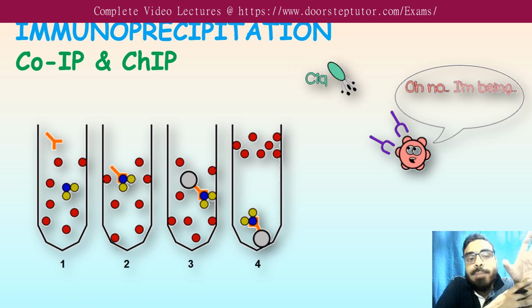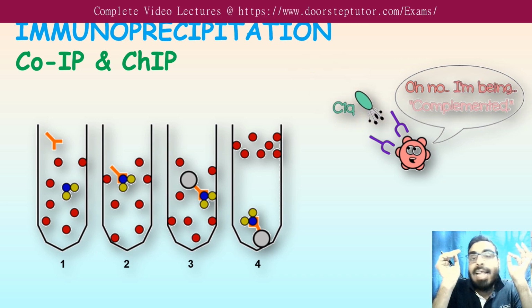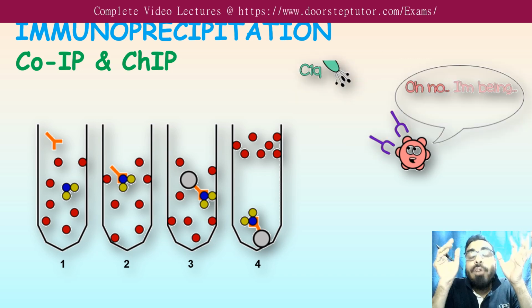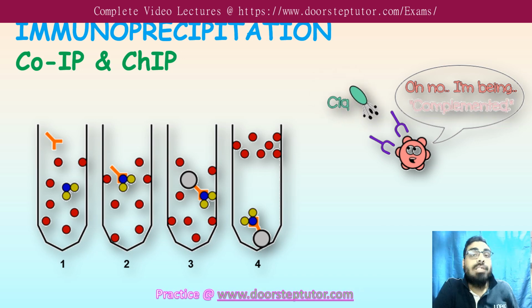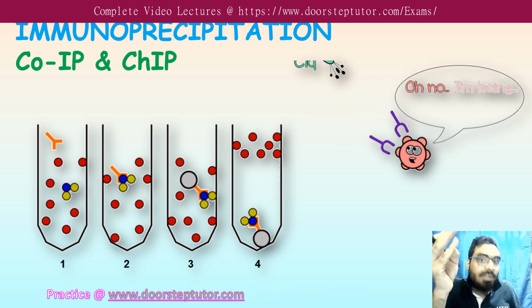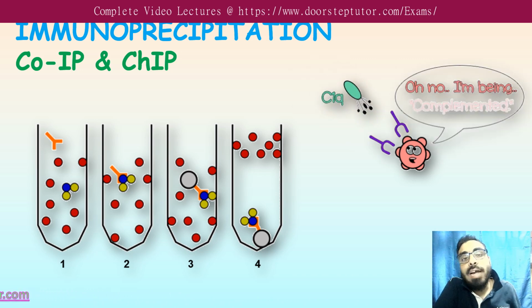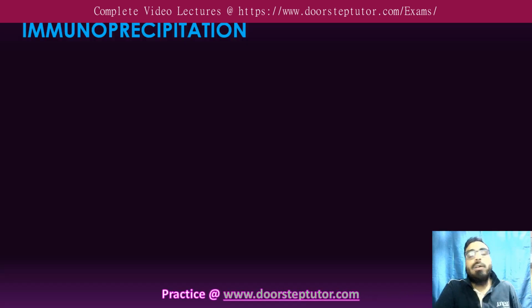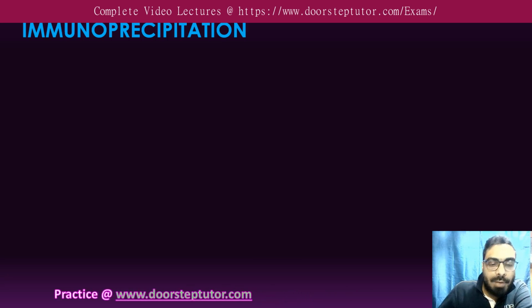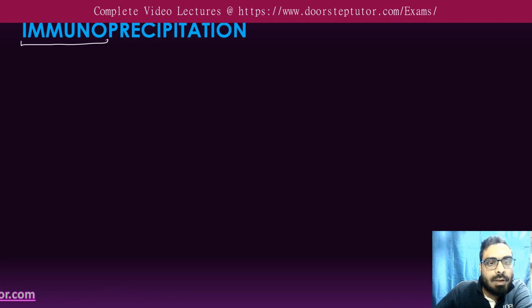As the name suggests, immuno means something from immunology is used here, and we already know what that is. We have discussed in previous classes what from immunology we use the most: in ELISA, also in Western blot. That was your antibodies. So yes, antibody will play a role here also. So let's see what is immunoprecipitation. The first point is that it uses antibodies.